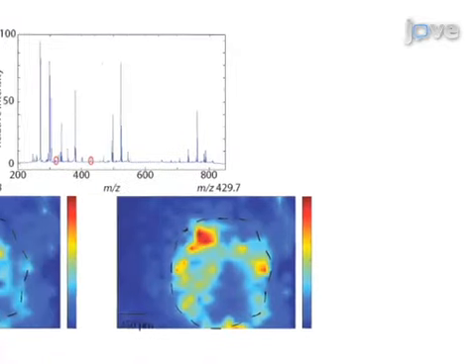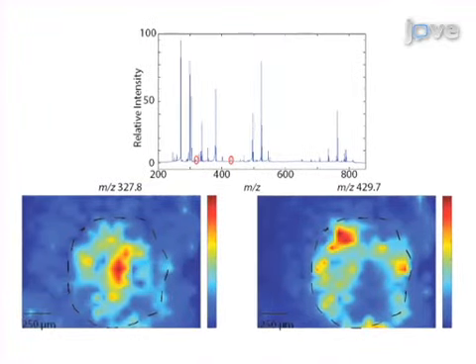Ultimately, mass spectrometry imaging is used to show the changes in distribution of analytes of many different biomolecule classes across the three-dimensional cell culture. The main advantage of this technique over existing methods like microscopy or autoradiography is that mass spec imaging allows detection and localization of multiple analytes such as proteins, lipids, drugs, and metabolites in a single experiment without any labeling.